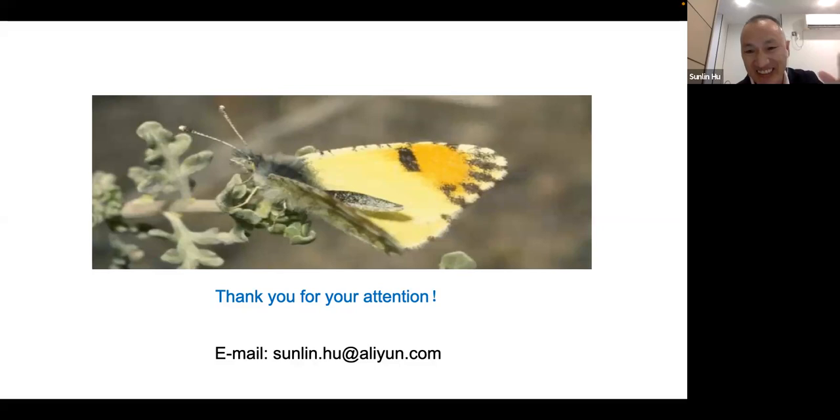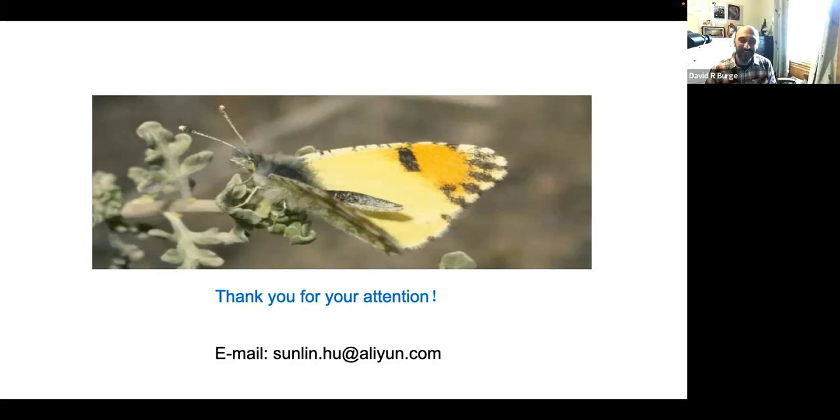But the magnifications are too low to detect diatoms in tissues accurately. So we gave up. It's very nice that you have this process automated with the SEM, and then you can get much higher magnification and better identification. So I see why the flow cytometry would not work.